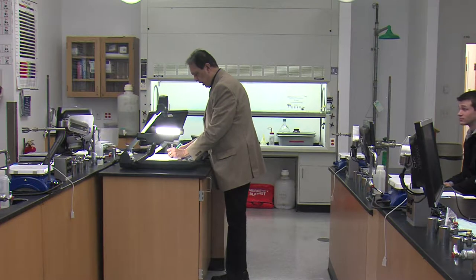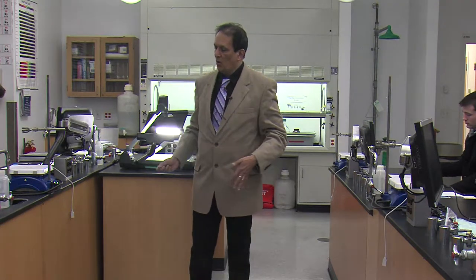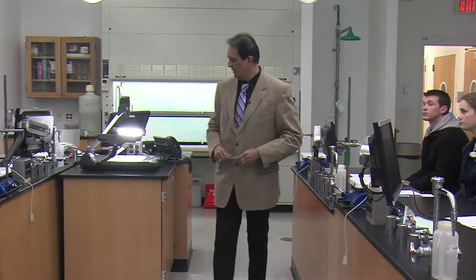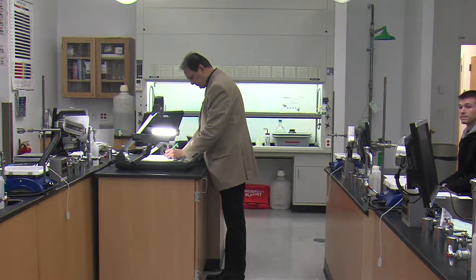Number 14, all loose clothing should be tucked in, all right? Once again, the same idea. If you have a long coat and you turn around and you have a Bunsen burner here, you are going to topple it, all right? And everything will catch fire, okay? So make sure you are following that.